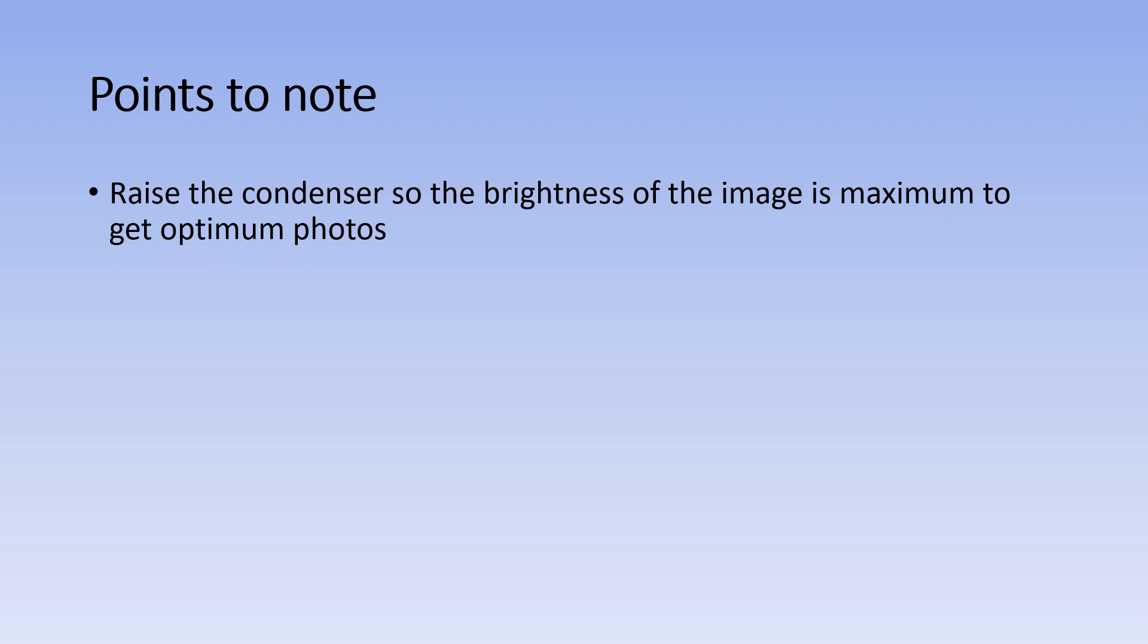Point to note is that you have to raise the condenser so that the brightness of the image is maximum to get the optimum focus.